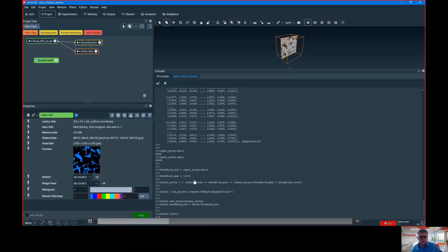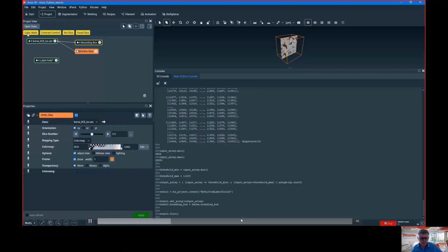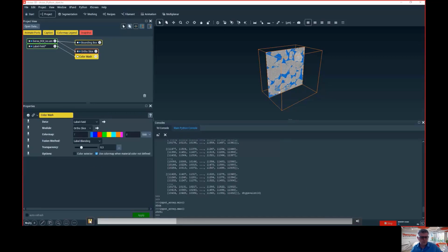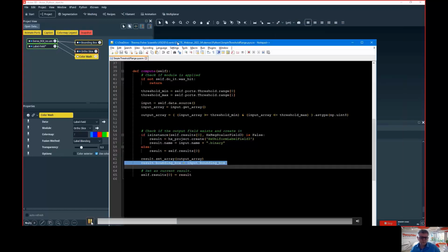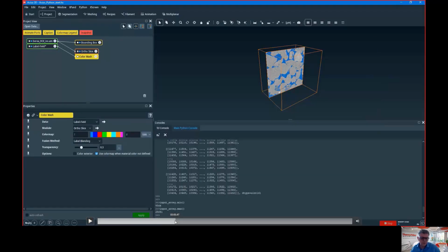So now it's just going on with connecting to visualize the data. With color wash, I can jump. By the way, I could have done this color wash, ortho slice, etc. in Python. It is possible. I told you to create objects, not only data. You can create computation modules, everything. So next is a little bit complex. It's a small jump because we have not much time.